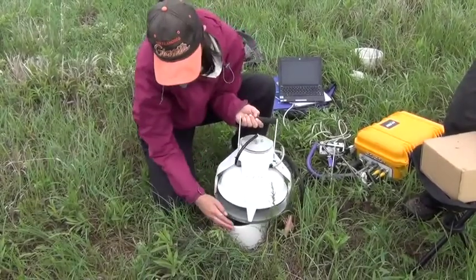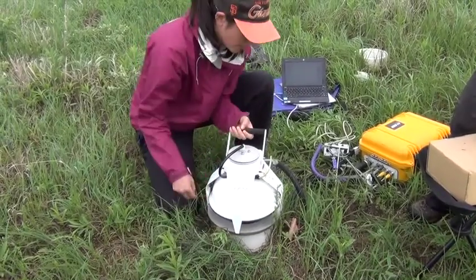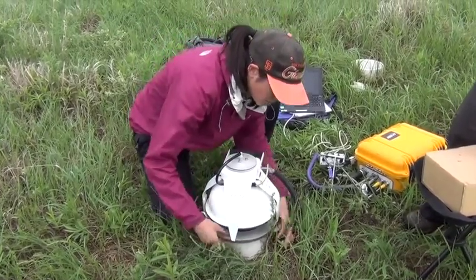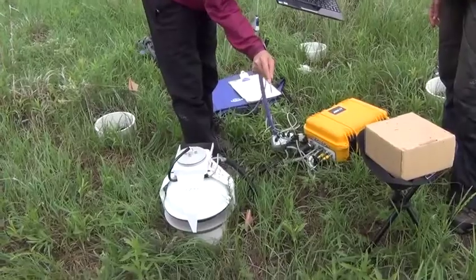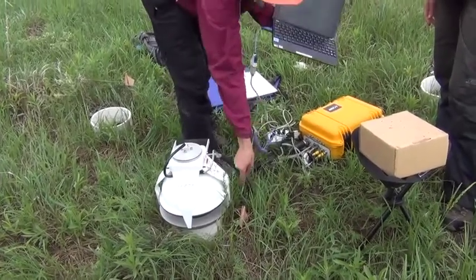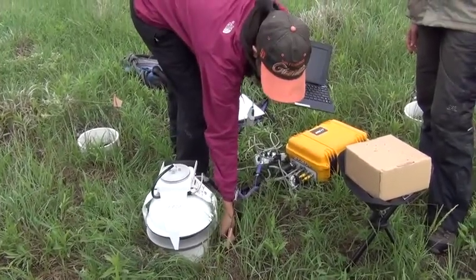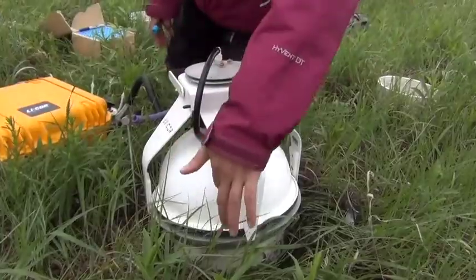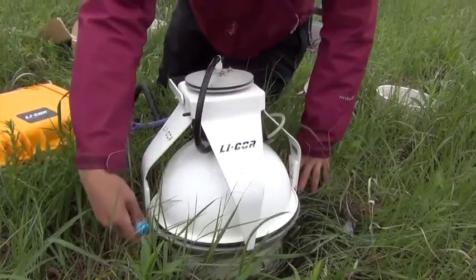Now let's see the instrument take a measurement. We start by placing the chamber onto the collar, being sure that we have a tight seal. Next, we insert our temperature probe. We want to measure temperature because it is a main control on soil respiration. Now the chamber closes automatically and the measurement begins.